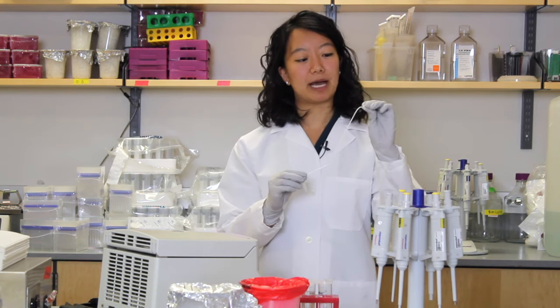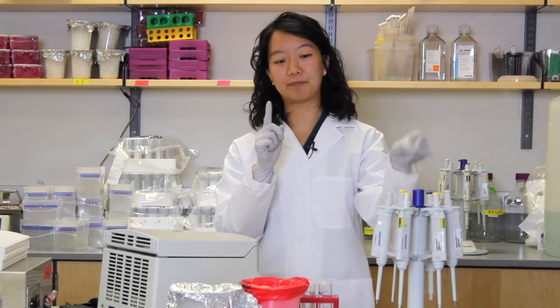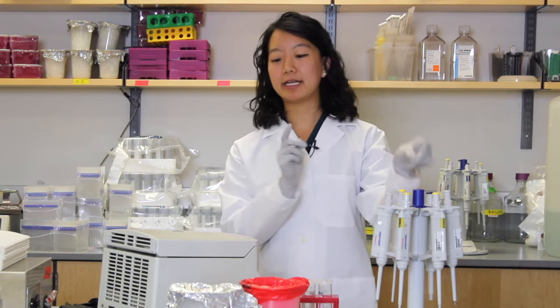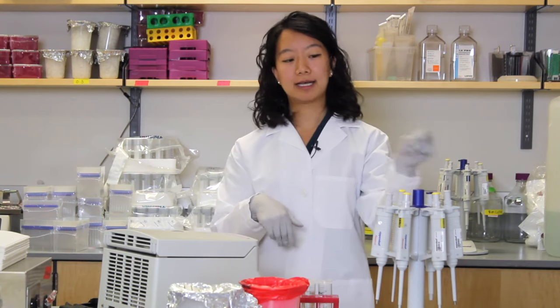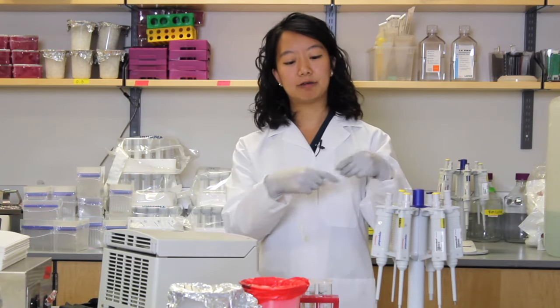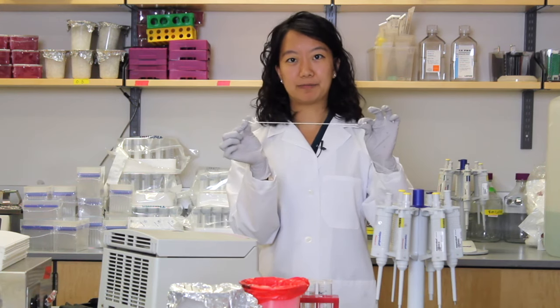The basic principles behind centrifugation involve rotation around a single axis. This creates a rotational force that goes in the direction of a circle. So if you imagine the center of my axes is in my hand here, and I have a circle of rotation, I have a rotational motion that's following the direction of the circle. The accelerative force that's created is shooting outwards, perpendicular from the circle, from all directions. This allows all of my sample to eventually gather at the very end of my tether, at the very end of the tube.